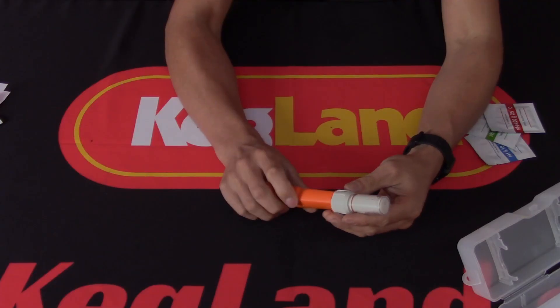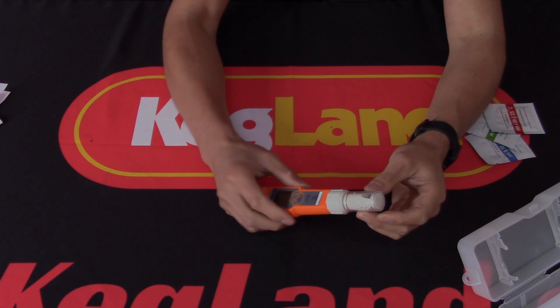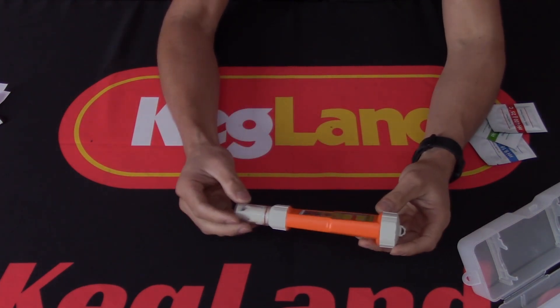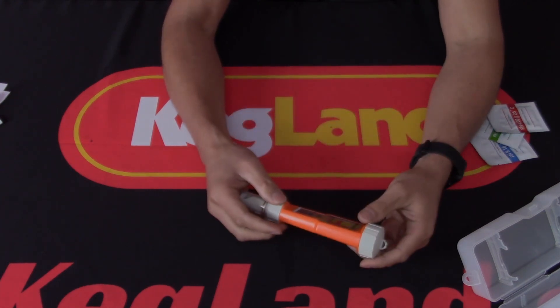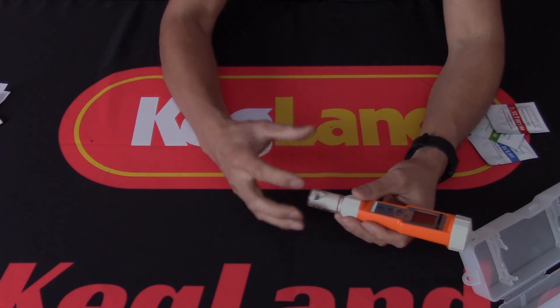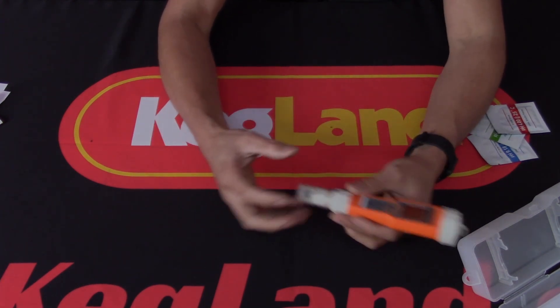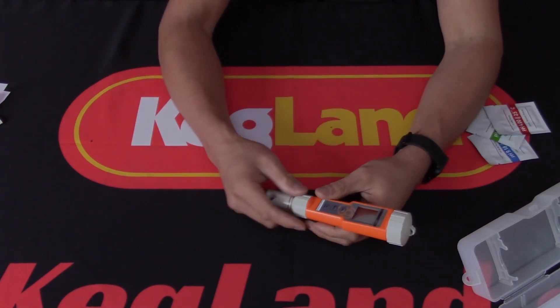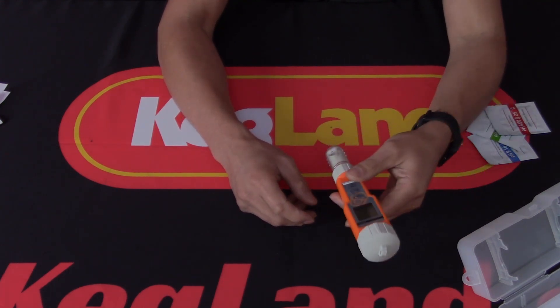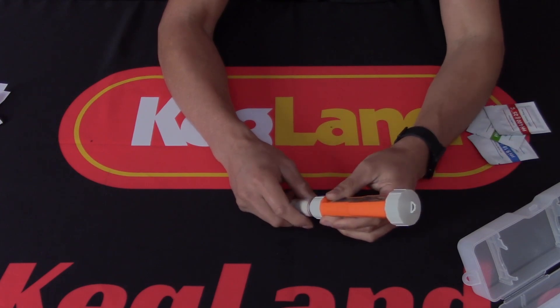If you take what we've said into action, your probes will last a long time and you'll get great use out of these pH meters. We think they're one of the best-value pH meters on the market — really quality built — and we supply storage solution and replacement probes. So if you do choose to get one of these digital pH meters, we think you'll be really happy.